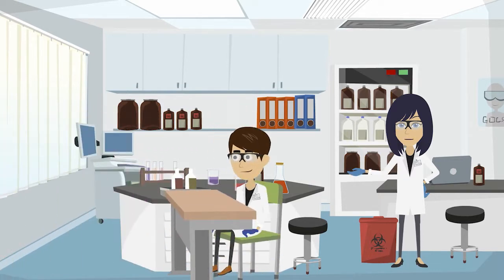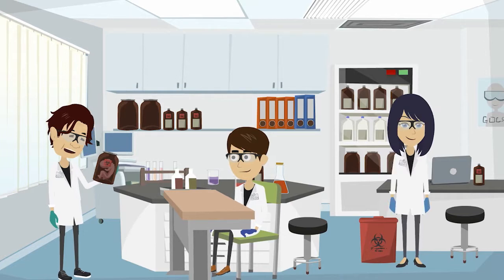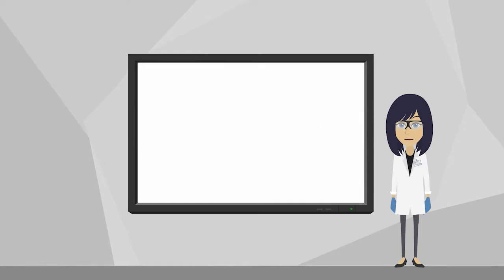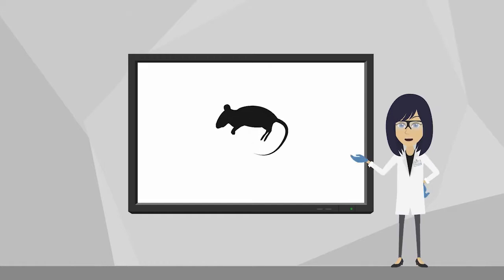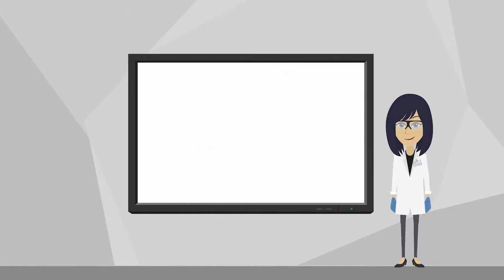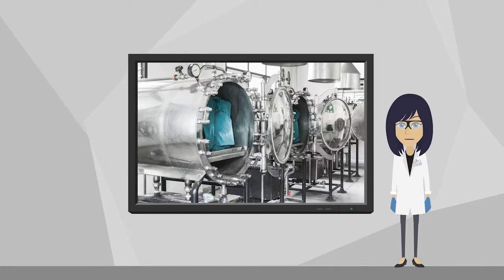While using an infectious agent, you must perform an additional lab-specific training. Handling of biological substances requires training. Wear PPE, and all wastes must be neutralized with 10% bleach. Animal carcasses must be disposed of in sealed bags or frozen. All biological wastes will be autoclaved before disposal.